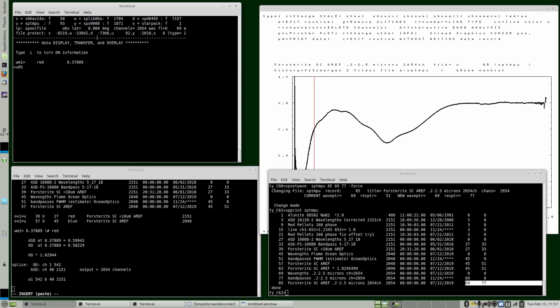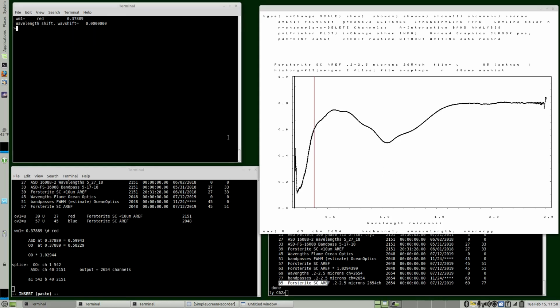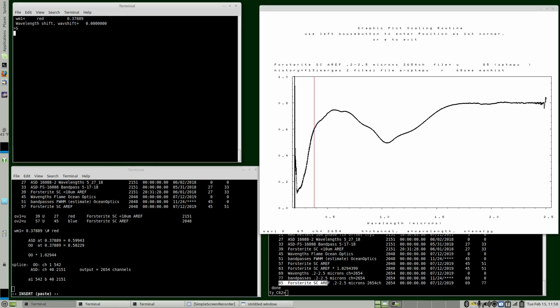Okay, so we're here, and we're going to copy the record, copy this spectrum to a new record. So we would do that with that, but we want to go into the, C was actually originally for CRTs because everybody was on CRTs. So go to the CRT plot routines and then copy to U. So now we're in the plot. Now we can zoom in.